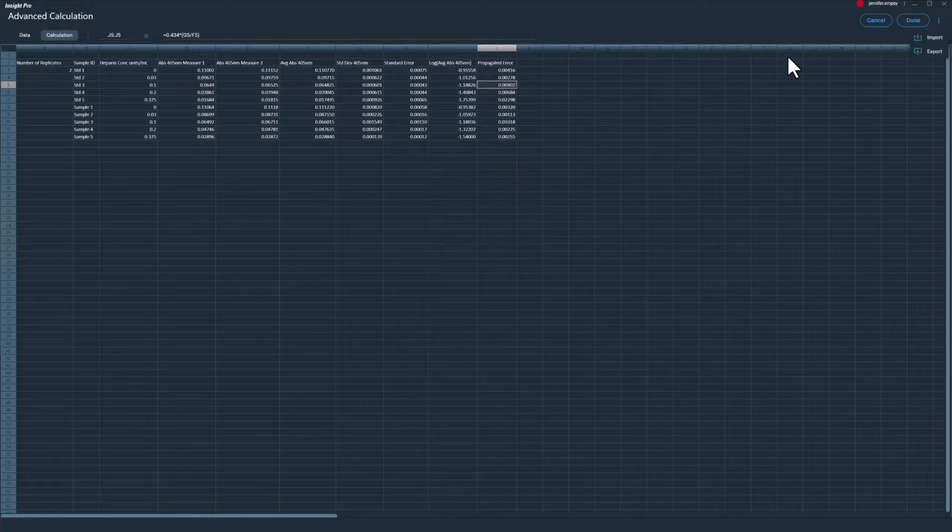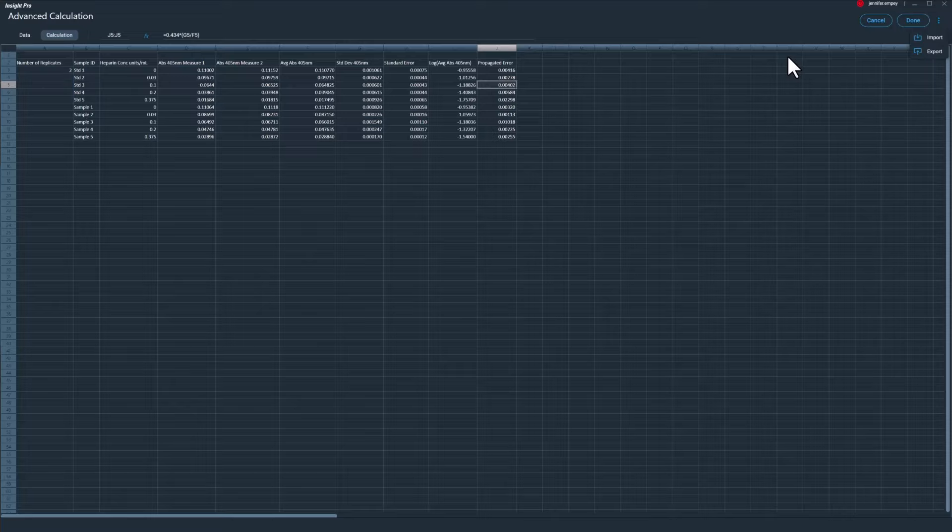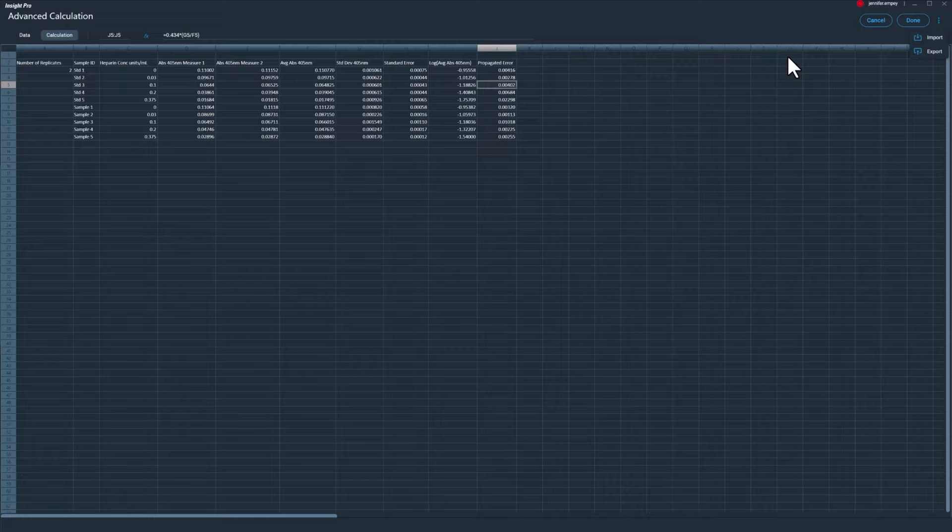The spreadsheet can be exported as an .xlsx file and read using Microsoft Excel. Additionally, analysis templates with predefined calculations can be imported into the Advanced Calculations spreadsheet using the same file format for ease of use. The generated spreadsheet can also be included in a printable report format.